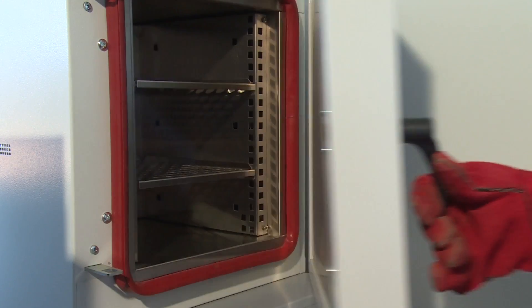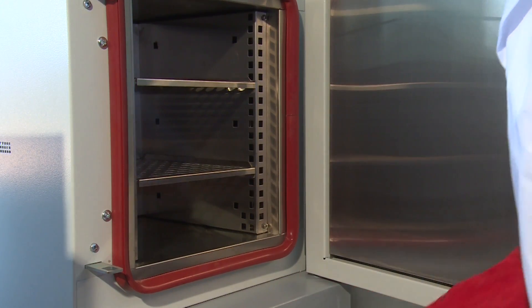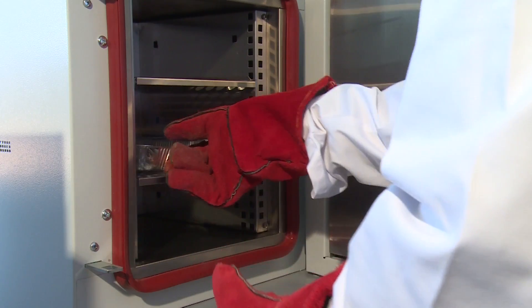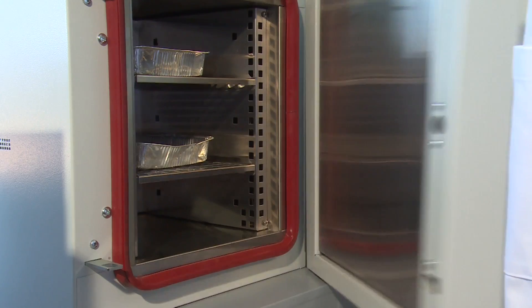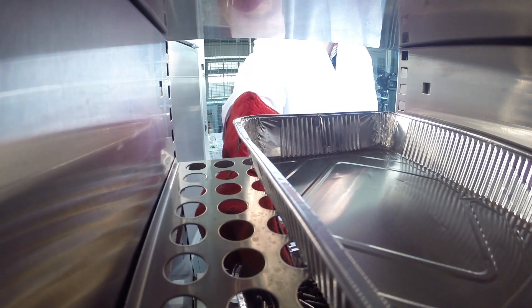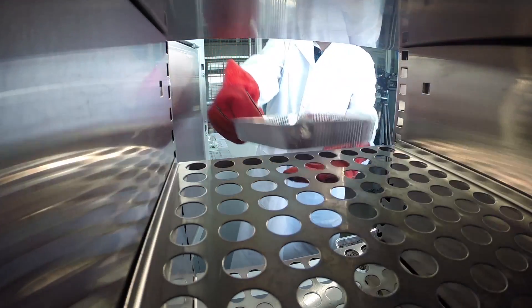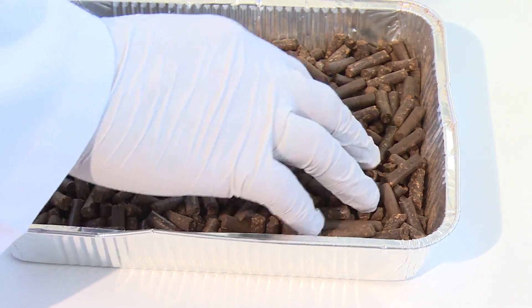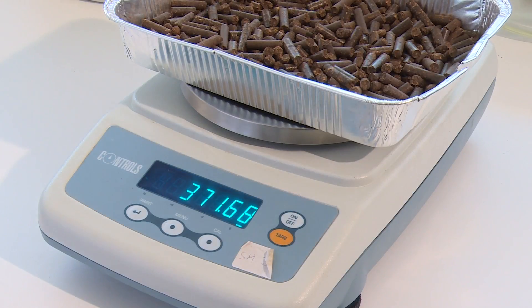The required equipment for the implementation of the test is a drying oven capable of being controlled at a temperature of 105 degrees Celsius, in which the air atmosphere changes between three and five times per hour. Dishes or trays of non-corrodible and heat resistant material, of such dimension that they will hold a total sample in the proportion of approximately one gram of sample per square centimeter, are also required.